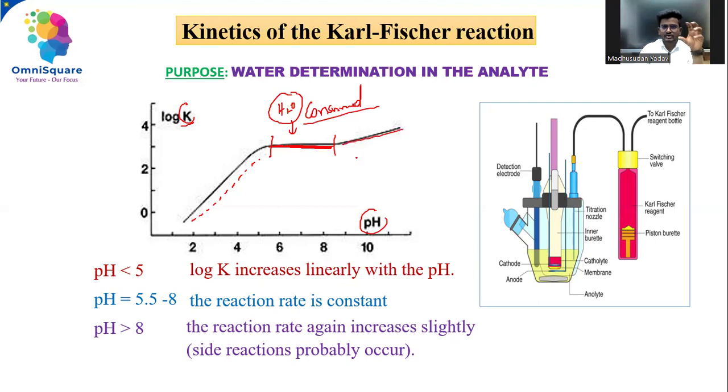What about this region? In Karl-Fischer titration, we use iodine and sulfur dioxide. Due to these buffer conditions, there may be some side reactions that take place. So this line indicates side reactions.